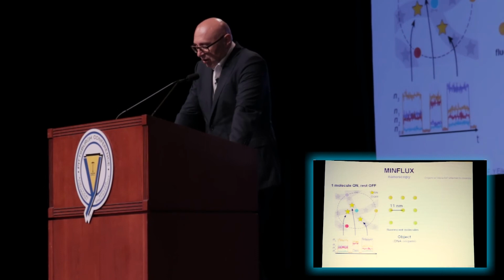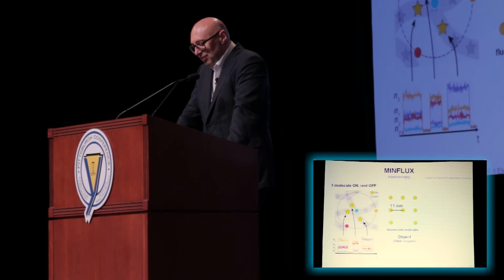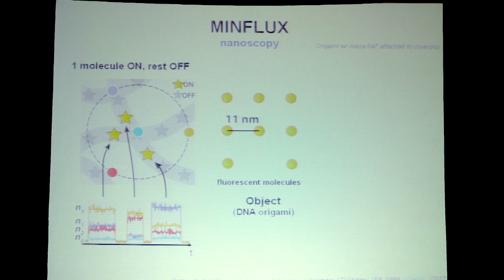Of course, you can also do imaging. As I said, true molecular resolution was not attained with the standard fluorophores at the time the Nobel Prize was given, only with some few exceptions. A molecular arrangement like this, where the molecules were just 11 nanometers apart, so this is a sketch of a specific molecular arrangement, could not be readily imaged.